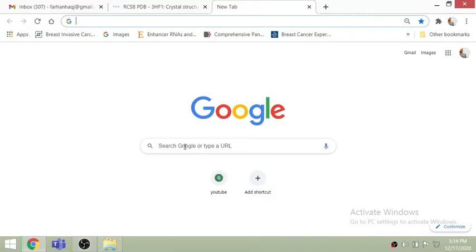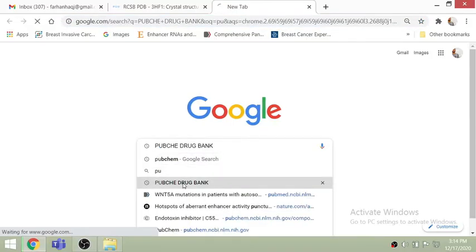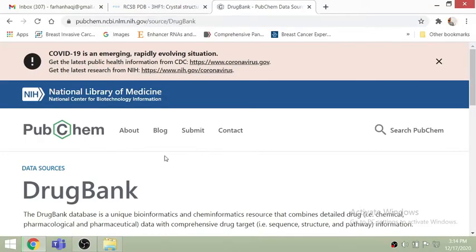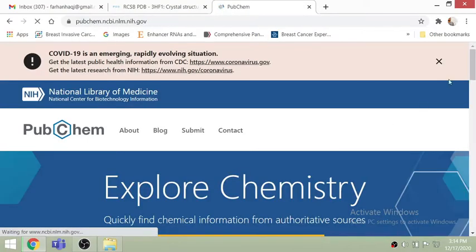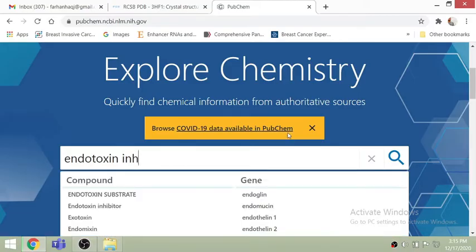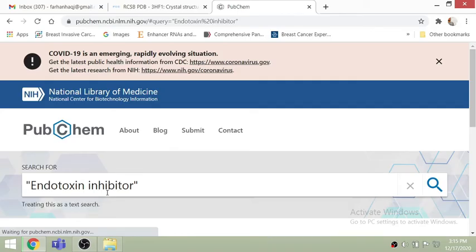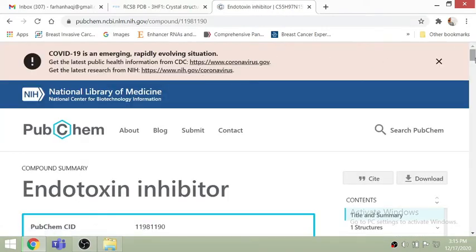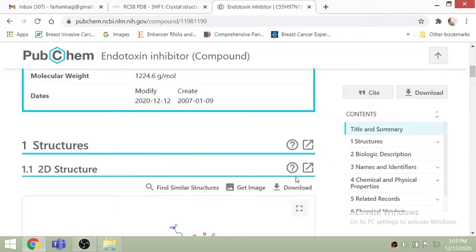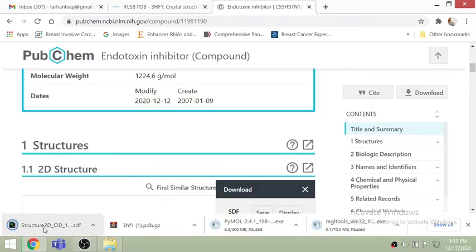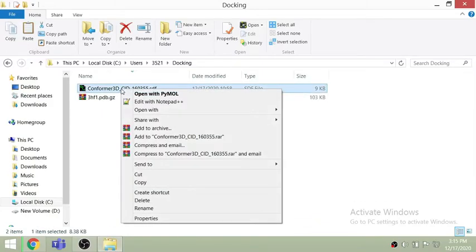Next, we want to see the interaction of this protein with a specific ligand. Go to pubchem.ncbi.nlm.nih.gov. Here you can search your ligand of interest. I am downloading the endotoxin inhibitor. I'm selecting it and downloading this file. The ligand file is in SDF format, while the protein was downloaded in PDB format. I will tell you how to manage these two different file extensions.